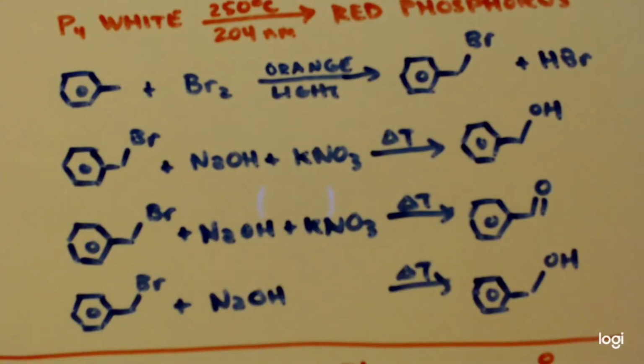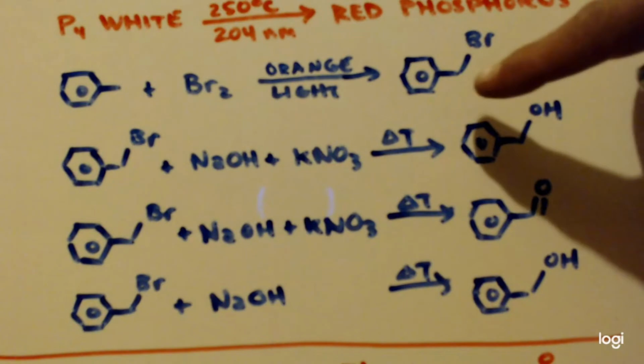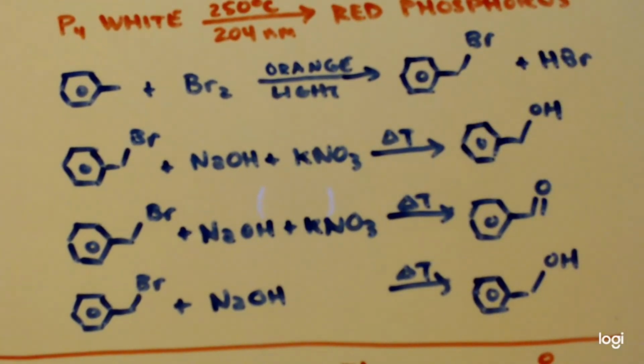And I'm going to take some toluene again with the light. I bought a light that's orange. Instead of 204 nanometers, I can't remember what it is. Maybe it's 520, I don't know. But it's orange light. It's good enough to break the bromine-bromine bond, but not strong enough to break the bromine-carbon bond. That's an important part. You don't just use UV light. You use the appropriate amount of light. And I'm going to make my benzyl bromide.